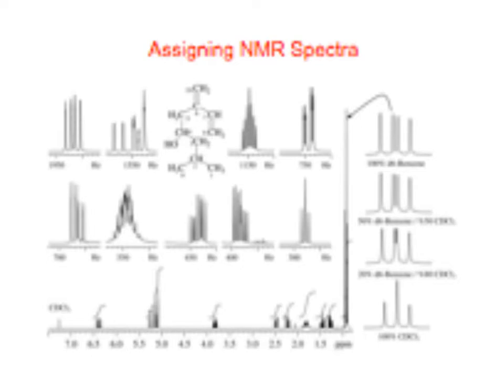Is one slightly larger? Yeah, one's a little taller than the other. So is it because as it rotates around, the OH? Well, why? Clearly these two methyl groups do not have the same chemical shift. They're not equivalent, right? So why is that? The OH.